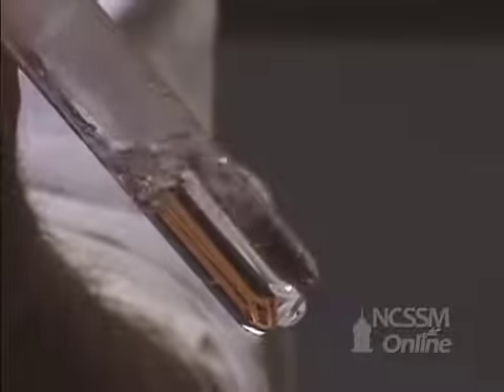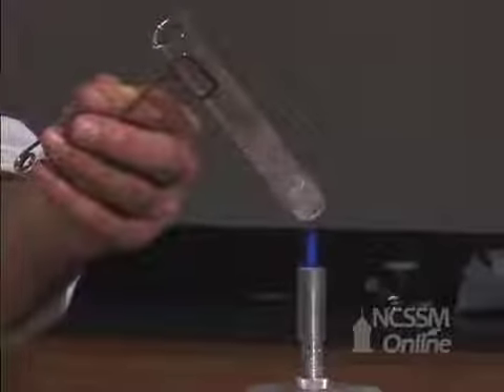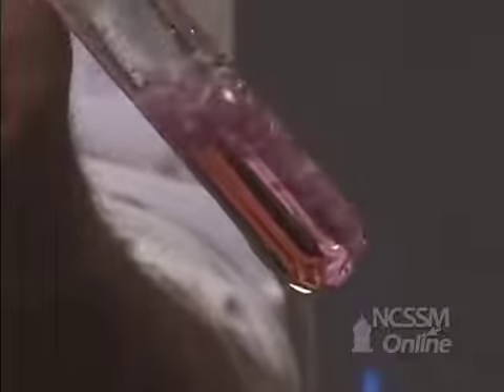In order to demonstrate that we're getting a reaction, we'll add some phenolphthalein to the test tube. The solution will turn purple due to the formation of magnesium hydroxide.